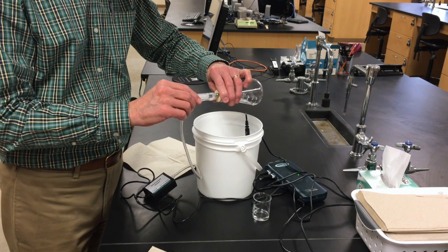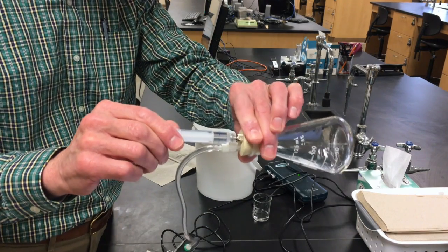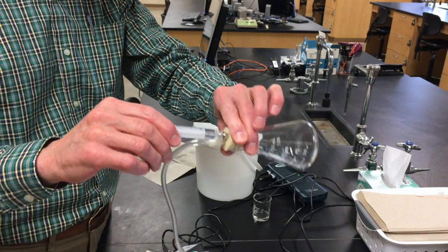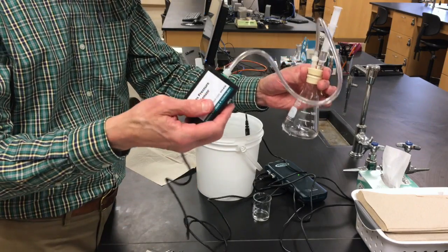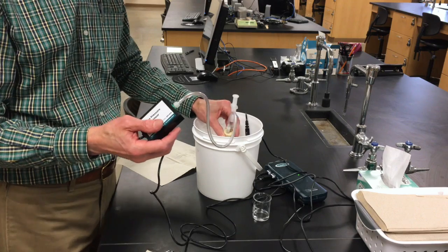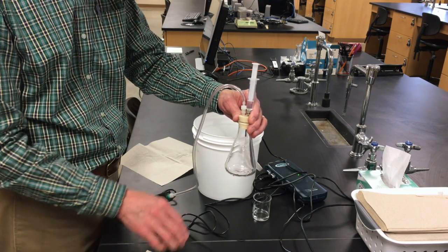It's called a Luer lock. The type of fitting is Luer, and it's a lock. It screws together and seals very, very snugly when you've got it good. So again, don't overdo it and strip the plastic. The metal will strip the plastic if you do it too hard, but be sure that it's good and secure. Now, the whole system, from the sensor all the way, everything is closed. The stopper is sealed, both ports are sealed, and we've got a good closed system. Now, don't disturb that system. That's how you get leaks if you mess with things.